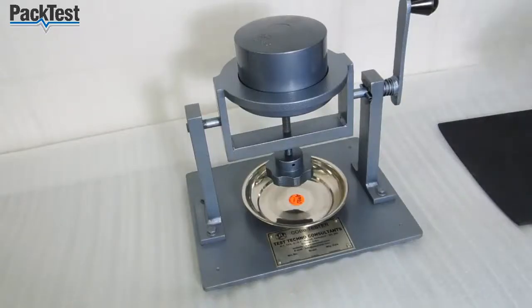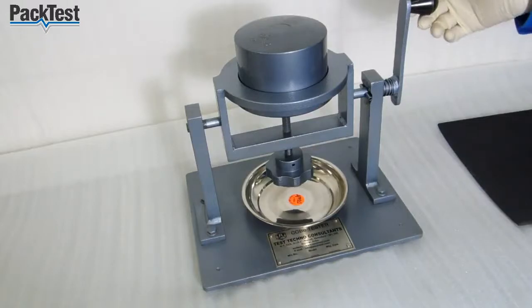Now rotate the handle to bring the machine in original position. Now loosen the screw and remove the sample carefully.